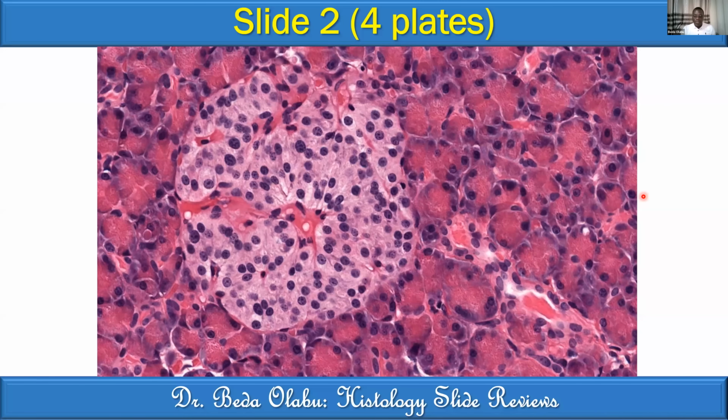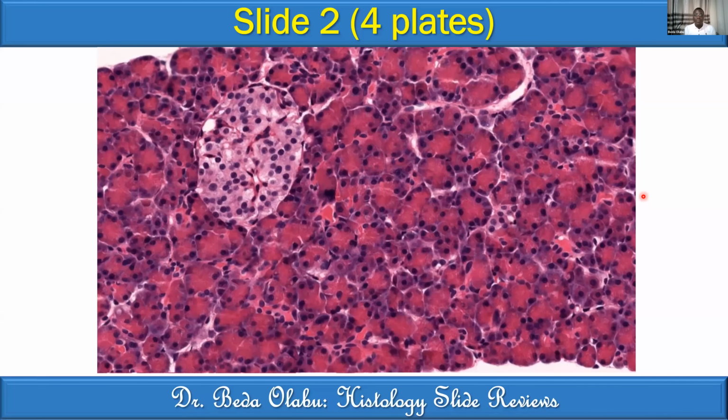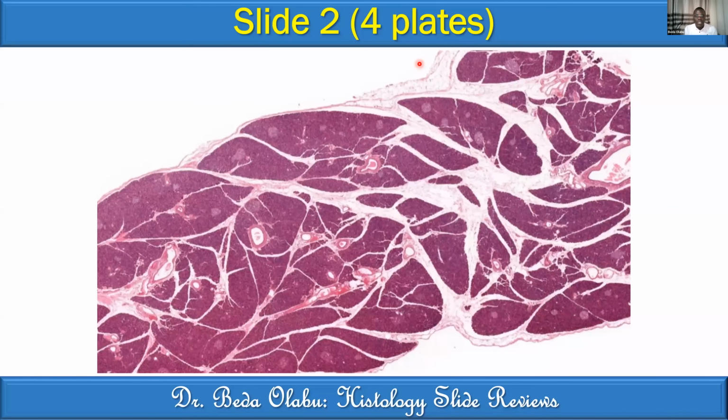All right, good. So let me hear from one or two people. I think it's better to go step by step, so I'll go back to the lowest magnification for you. Any volunteer to describe this one? We can walk through the four levels of magnification one by one. Just put up your hand and I'll enable your mic. We describe together. We'll just be reading what you've written down for each magnification, and I'll guide you.